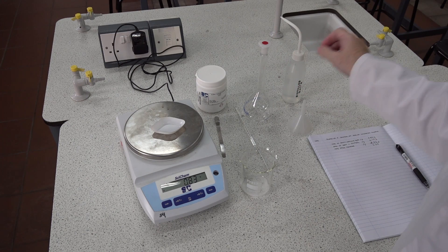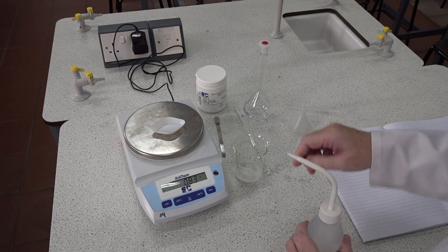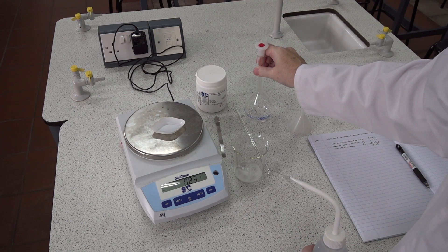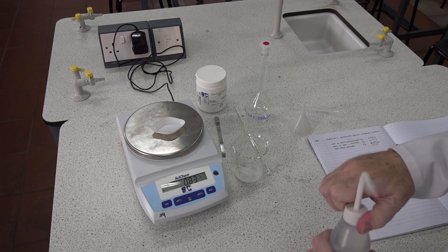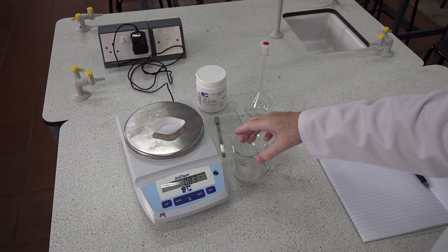Next we need to dissolve the sodium hydrogen sulfate. We know that the volume of the volumetric flask is 250 centimeters cubed, so we can dissolve or add water to about the 100–150 mL mark on the beaker.